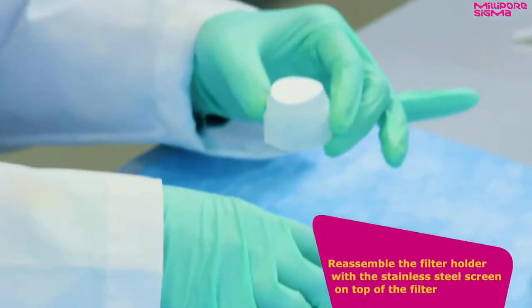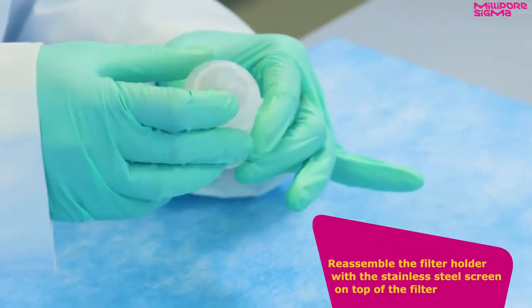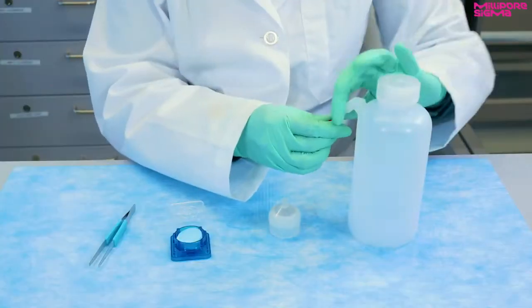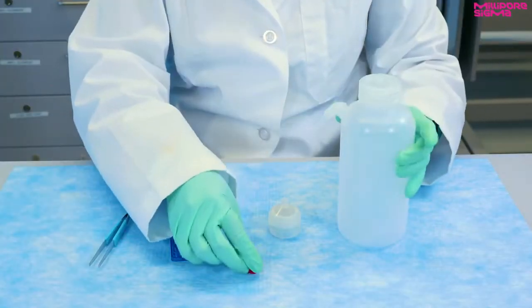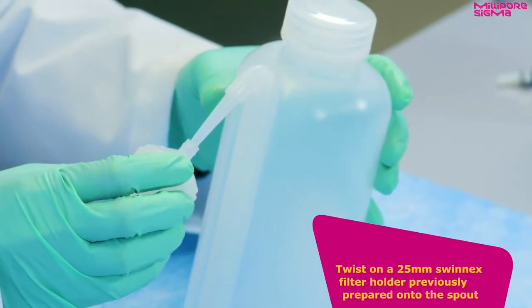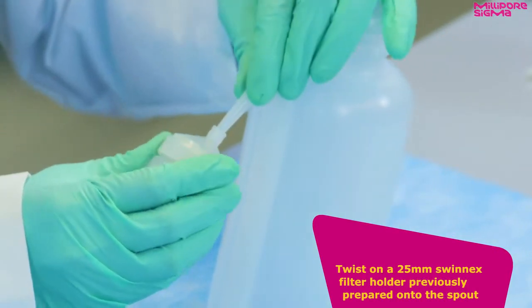Reassemble the filter holder with the stainless steel screen on top of the filter. Remove the plastic cap from the spout of the wash bottle and twist on the 25 millimeter Swinnex filter holder previously prepared onto the spout.